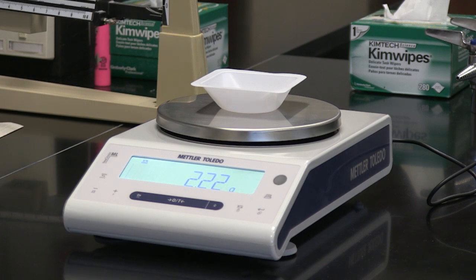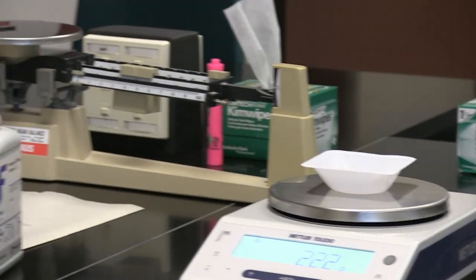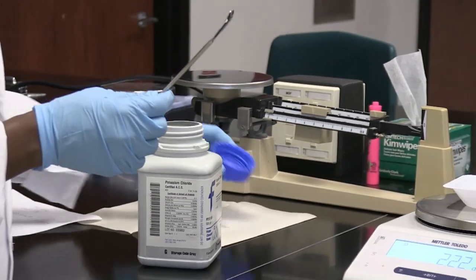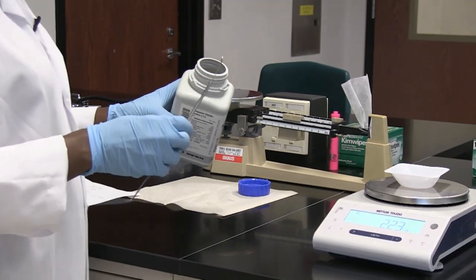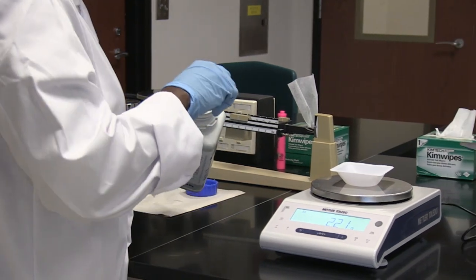Then I'm going to use a spatula. This is a spatula that can be used to take up quantities of the salt from the container onto the weigh boat. So I'm going to do that.